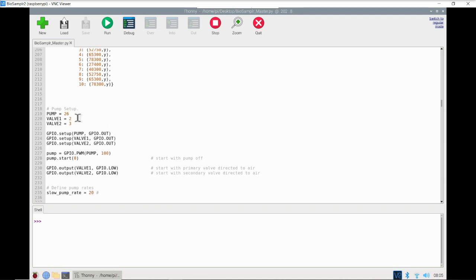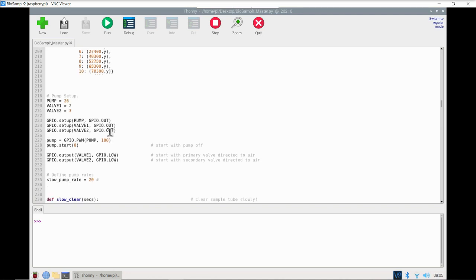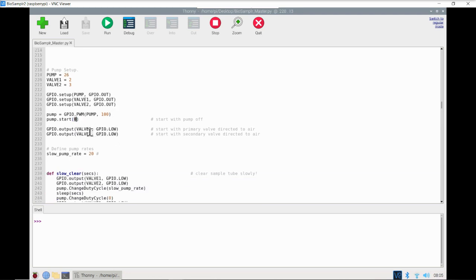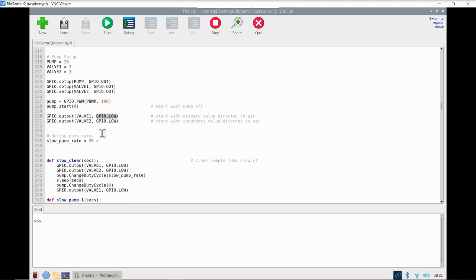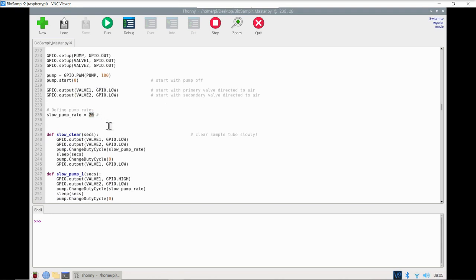Next, we set up our pump and our valves. We define some GPIO pins, set those pins as outputs, and start our pump with a duty cycle of zero so it's off to begin with. We start our two valves with their pins set low, which means they're in their primary position. The pump duty cycle is set to 20%. If the pump is moving too fast it can move fluids too aggressively and leave fluid droplets on the sides of tubing. If it's too slow, the pump can be inconsistent or sometimes not pump at all.